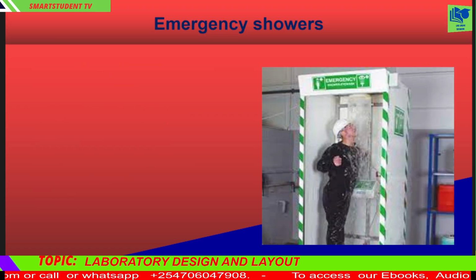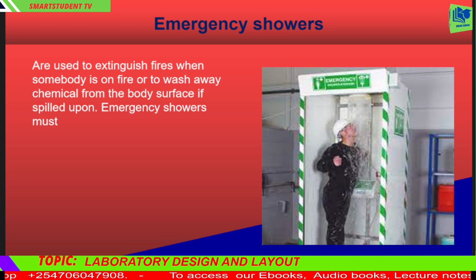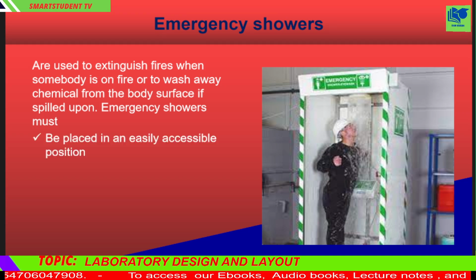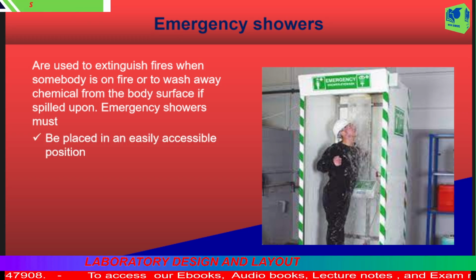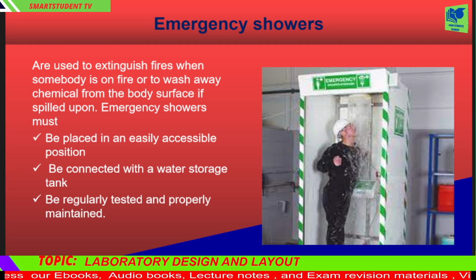14. Emergency showers. Emergency showers are very important because they are used to extinguish fires when somebody is on fire or to wash away chemical from the body surface if spilled upon. Emergency showers must be placed in an easily accessible position. They should be connected with a water storage tank. They must be regularly tested and properly maintained.